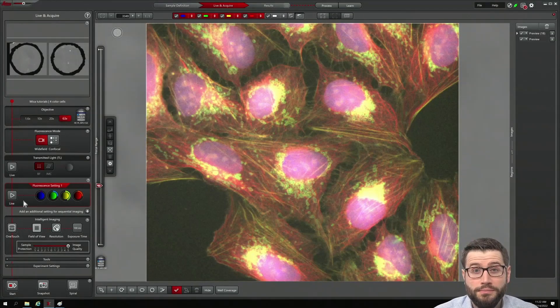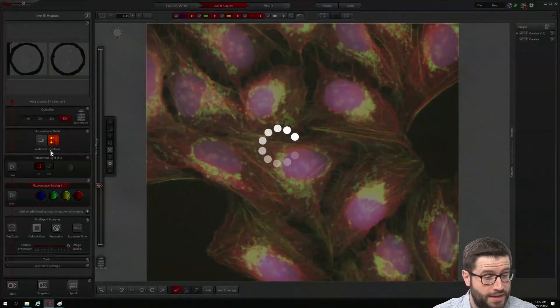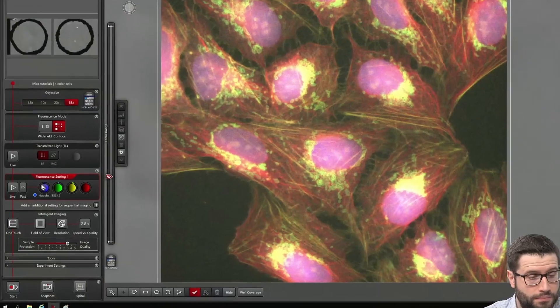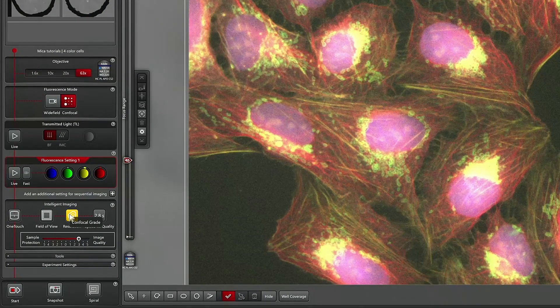How does it look like in Confocal? Well, basically it's the same. However, two things have changed.